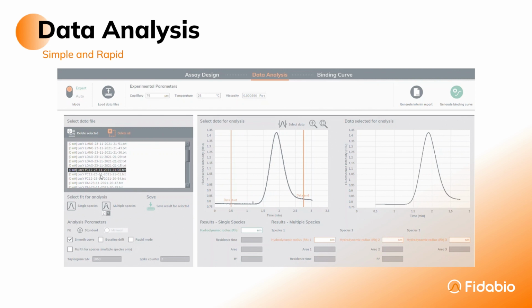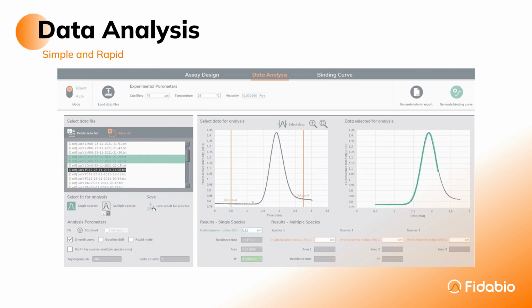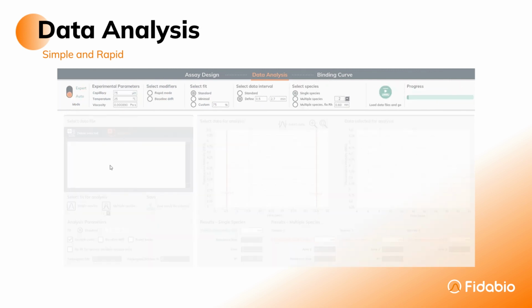When the measurements are done and you have loaded your raw data, it is a good idea to take a quick look at them to see if all is fine. You can start fitting your data manually, one by one, but it can be a little bit tedious and long, especially if you have many samples. So you can use our auto mode, where you can select the standard fit, the data interval, single or multiple species, and then load your dataset to auto fit, like I'm doing here.